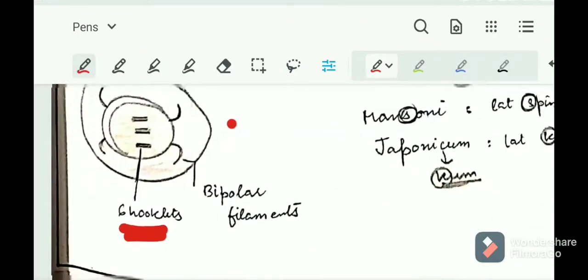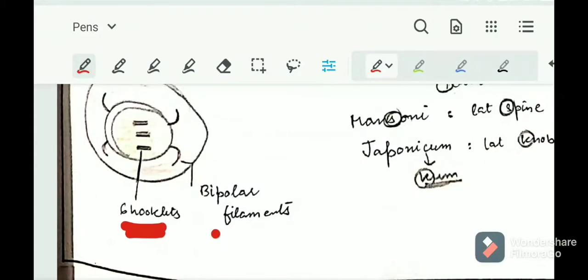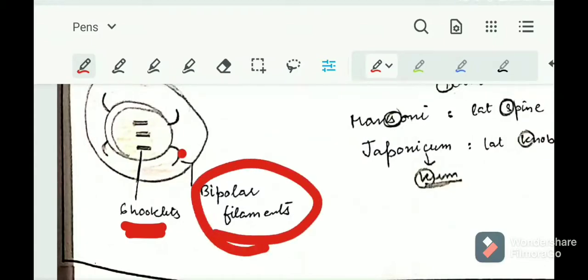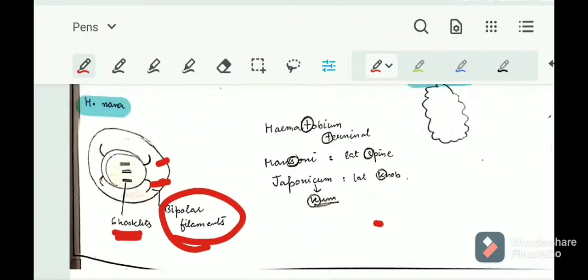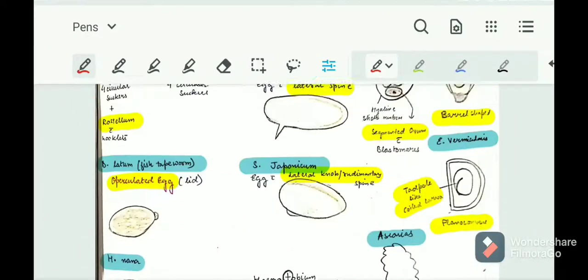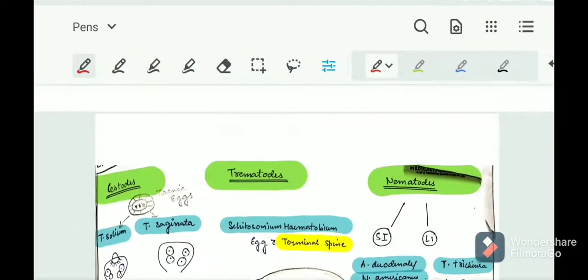Next is Hymenolepis nana. H. nana will have a round egg with six hooklets inside it, and bipolar filaments — small filaments present at both ends of the egg. So bipolar filaments at both ends, and six hooklets inside the egg.